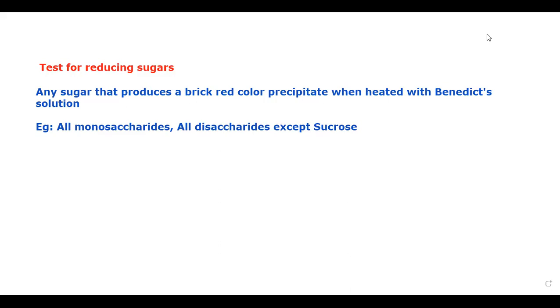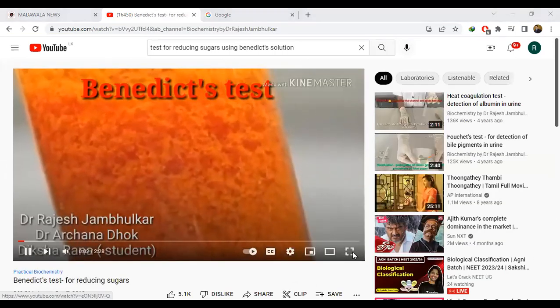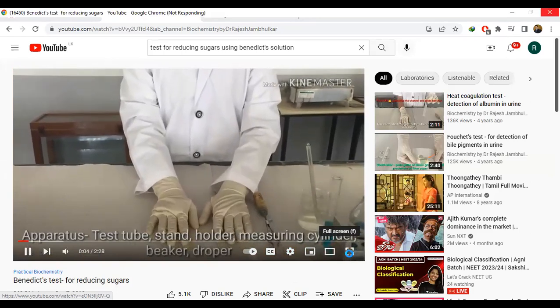Completed. Yes, sir. Right. Now, let's have a look at this video. We are going to perform the Benedict test.